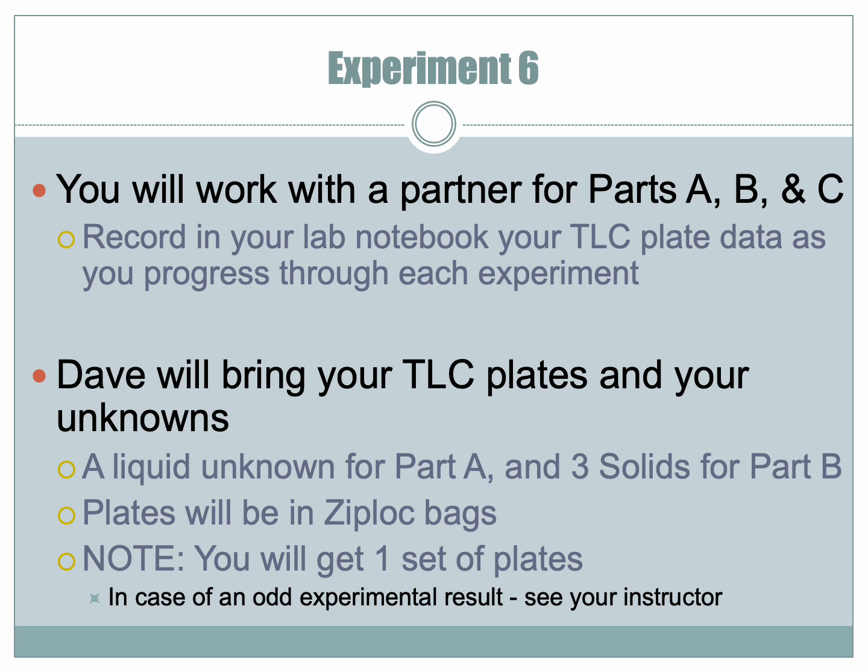So in all of these parts, you're going to work with a partner. So it will be partners next week, parts A, B, and C. Record in your lab notebook your TLC plate data as you progress through each experiment. So you should draw pictures of your TLC plates in your notebook so you have some evidence of what you've done. A liquid unknown for part A and 3 solids for part B.